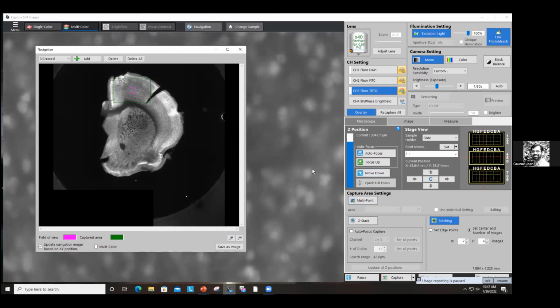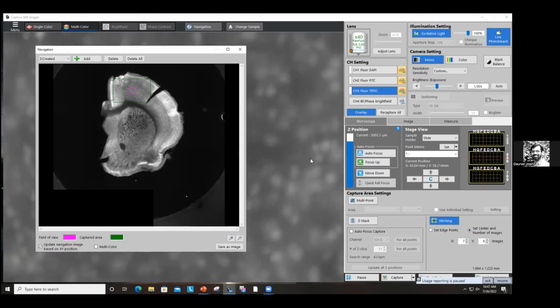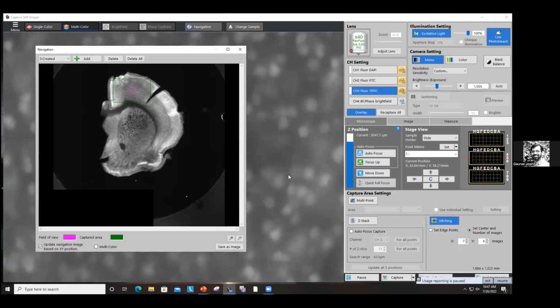So if you were to be somewhere out of focus and then you say, okay, I can again go and set my Z and this is what I want imaged, you will not get that. You will have to start from in focus. Let's say I'm happy with this focus, I will uncheck my stitch and then again say, do 7x6. And now this is exactly what I'll get. If I set this up out of focus and then go back to in focus and start stitching, it won't work out.